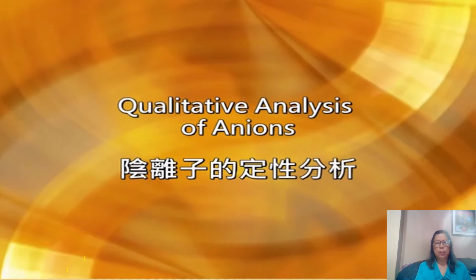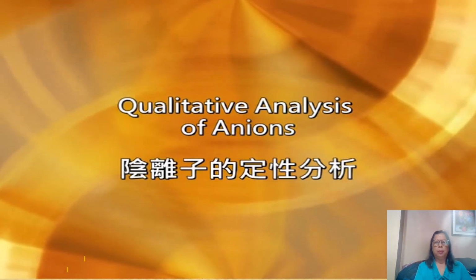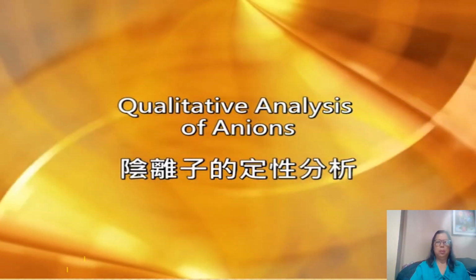Okay, that is for your test for cation. Now let us try to look into qualitative tests for anions. Qualitative analysis of anions.